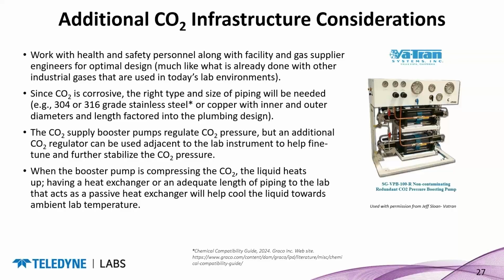The booster pumps regulate the CO2 pressure, but you may also want to put a CO2 regulator next to an instrument, especially an analytical instrument, where you really need to fine-tune that pressure. Our prep systems don't care quite as much what the pressure is, and can make adjustments accordingly.